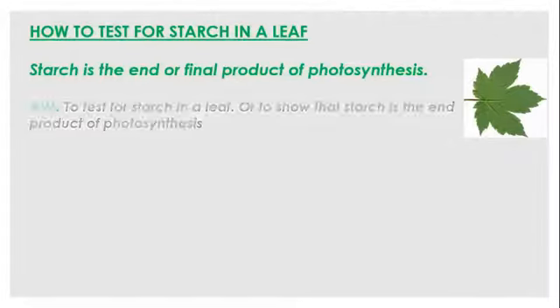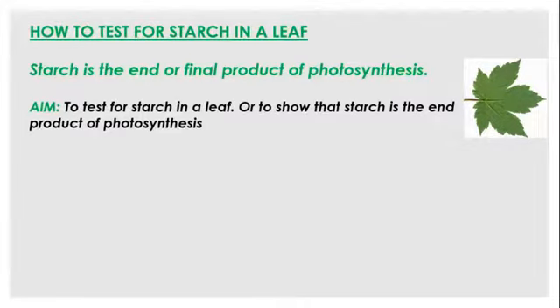So what is the aim? The aim is to test for starch in a leaf, or to show that starch is the end product of photosynthesis.